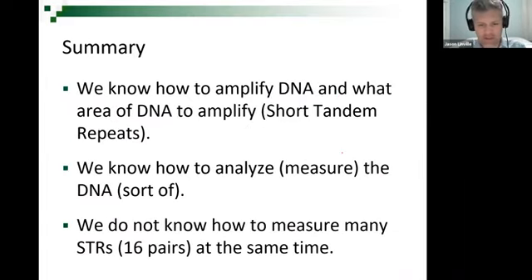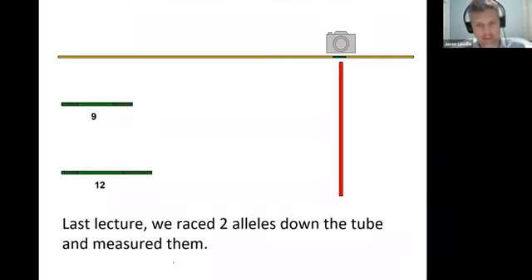We know how to amplify DNA, and we just sort of learned how to measure the DNA and detect it, sort of. Okay, but we don't know how to measure many STRs. So let's go through this example that we had before. And I want you to focus on, let's say that we're just analyzing 1 locus.